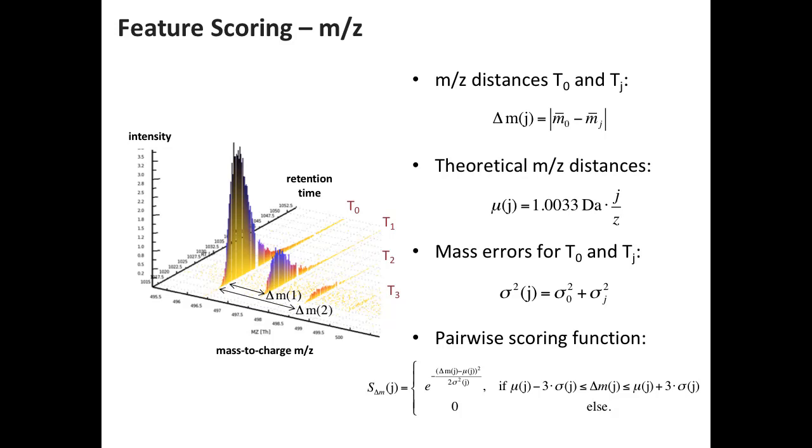Actually now we have much better mass errors than we had in proteomics, because we estimate these mass errors on the mass traces themselves, and that narrows down the options of how to combine these mass traces drastically. So we have a scoring function that looks at all these distances and assumes a normal distribution for the error and scores it accordingly. If they have exactly the perfect spacing, they get a high score. If they deviate for whatever reason, for example because the mass trace has too low intensity and thus wiggles around, then it gets a lower score.